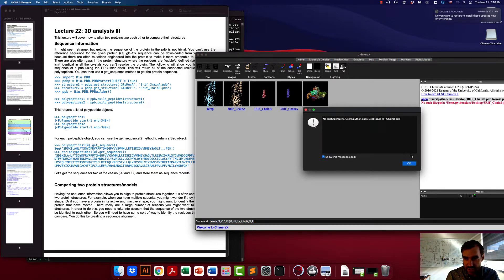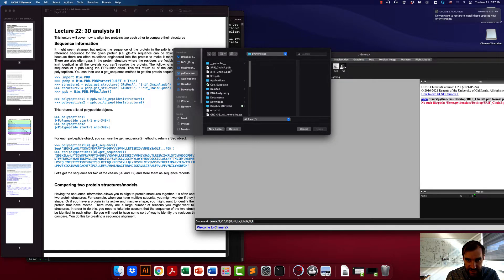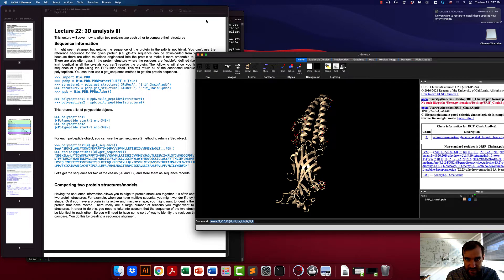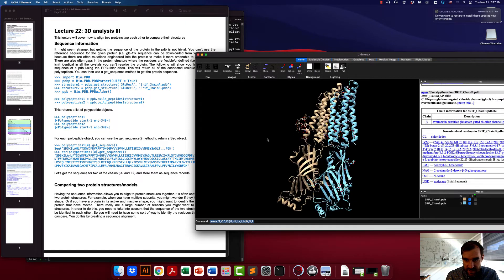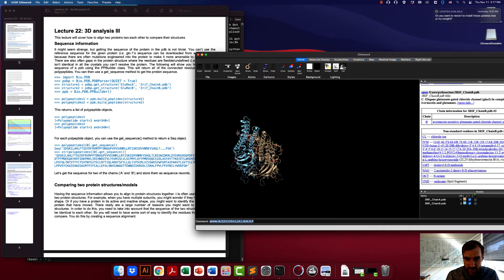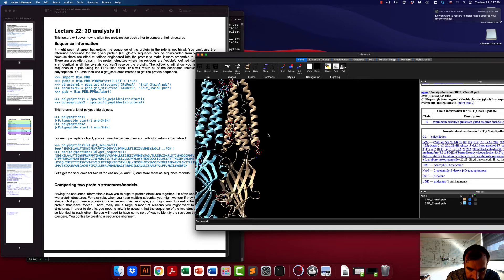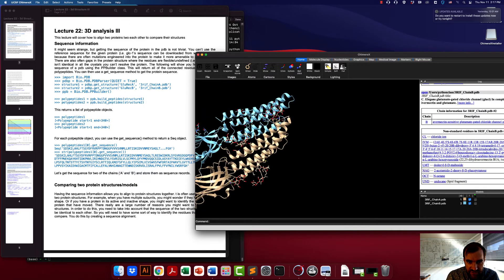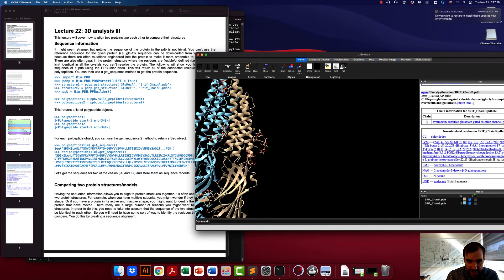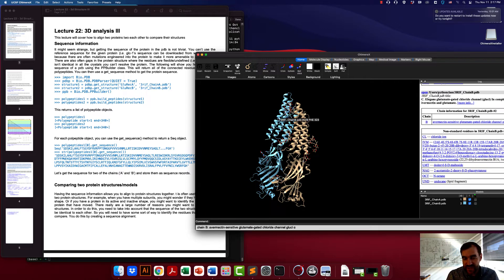As a silly example, I have gone ahead and taken the glutamate-gated ion channel and deleted some of the chains, so now we just have two of the chains. There are two different PDB files — one that just contains the A chain and one that just contains the B chain. You can see that these subunits are very similar to each other in shape, and you might want to align these together so that you can really compare them.